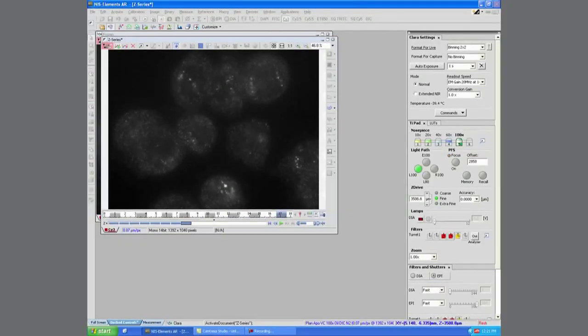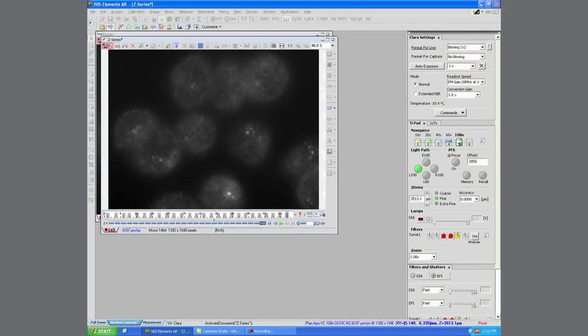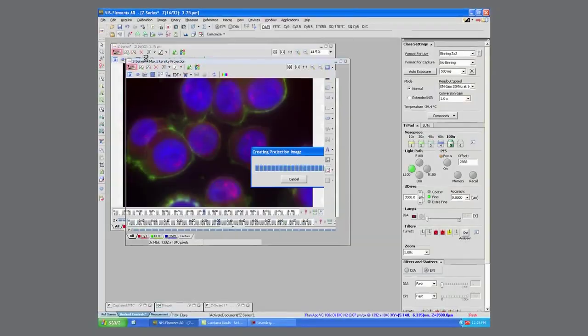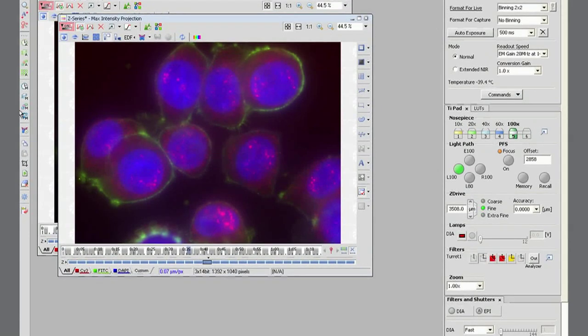So you take your slide, put it on the fluorescence microscope, and focus in on your cells using the nuclear DAPI stain. Once that's done, proceed to the appropriate channel and focus in on your mRNAs and take an automated Z-stack. Next, proceed to the appropriate channel to look at your protein and take the same number of Z-stacks. And finally, just merge the two under a maximum intensity merge and you'll have nice, beautiful pictures of your mRNAs and protein. That's it, that's all there is to it.